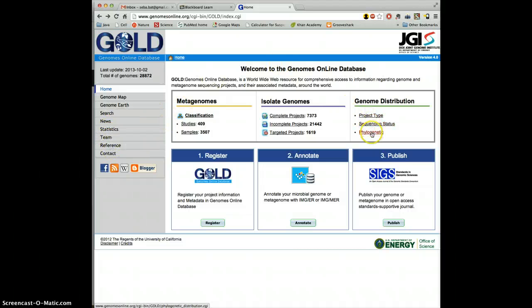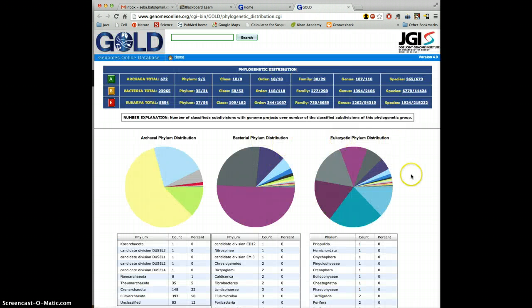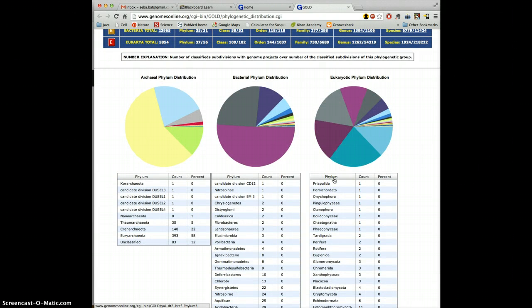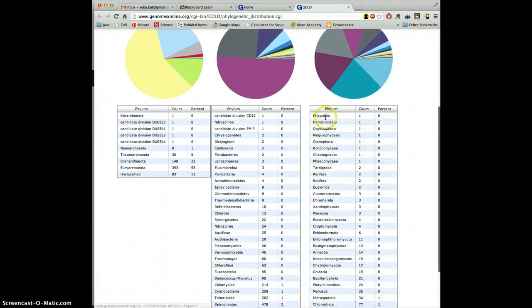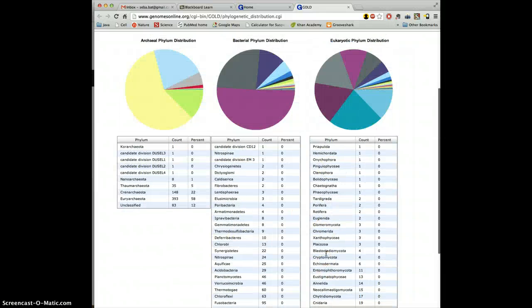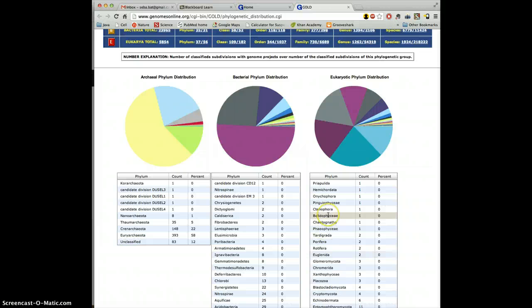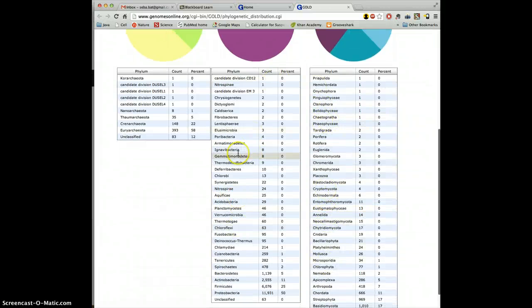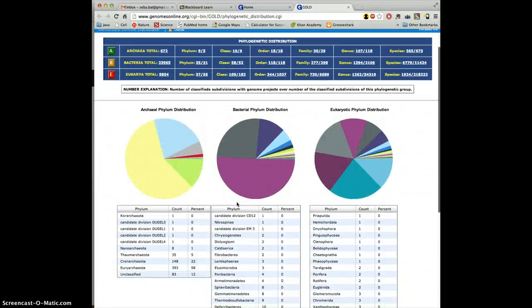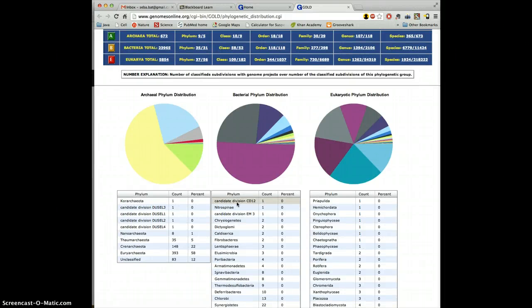let's look at the phylogenetic page if it opens. Here, based on the phylum, it can give you a distribution of all the phyla, the plural of phylum. And here it says how many are those. If you count how many we have here, and look at the numbers in the paper, we can see that these numbers here are way higher. There are way more phyla in here than there were in the paper. That's a demonstration of how rapidly the metagenomic field is increasing and creating available data for the public.